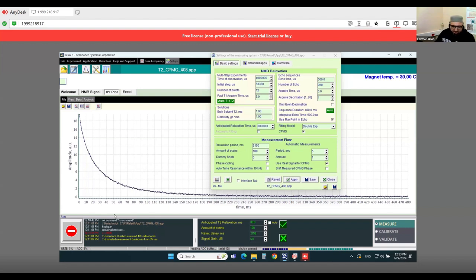So these are some things when you are using the time domain and testing different types of samples. These are some obstacles, some things which happen to you, and you have to manage them to get good results. So I explained some of the T2 measurement, the T1 measurement, and what you can face while measuring the T1 and T2 spin relaxation.